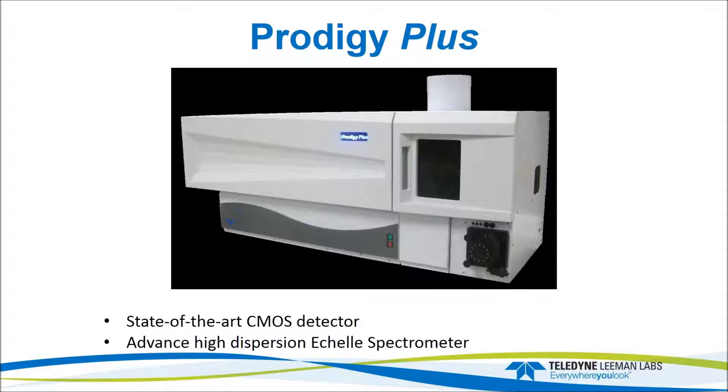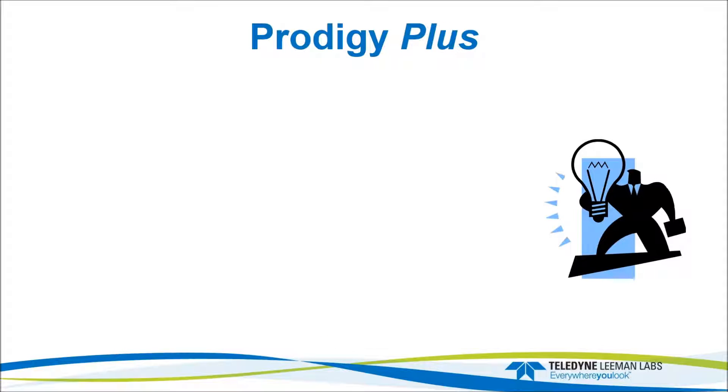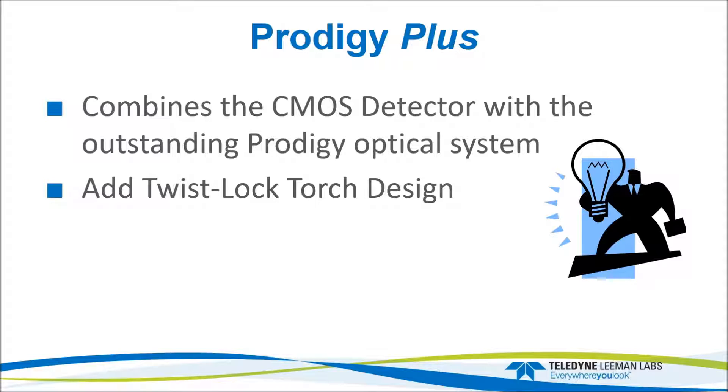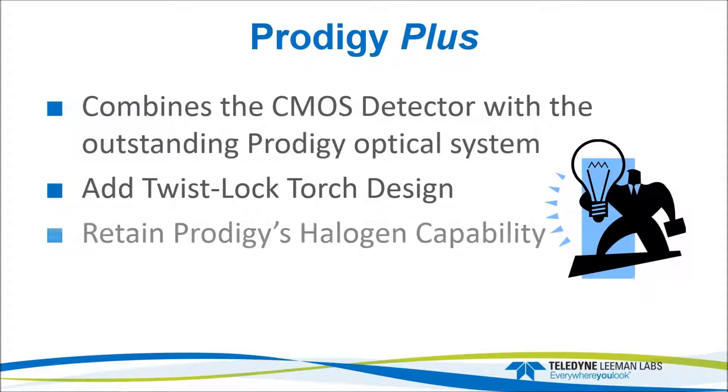Here's the Prodigy Plus. It's based on the Prodigy ICP, so externally it's very similar in design. We've made a couple of changes. We've taken the best of what was on our Prodigy 7 ICP — that's the CMOS detector — along with the plug-and-play of the twist-lock torch design. So two major changes, and we'll take a look at some of the other features of the instrument.